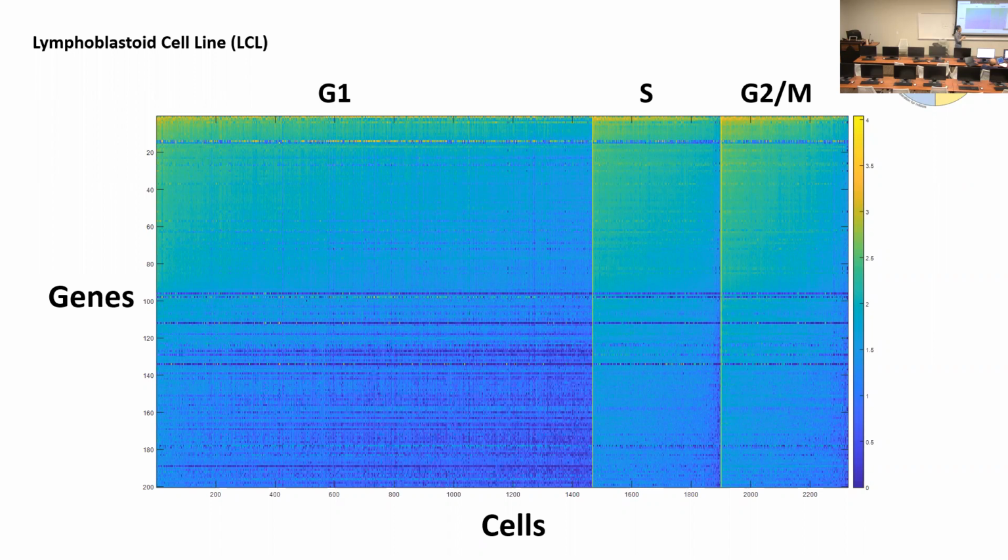But our definition of gene expression noise is that the cells have to be the same cell type and in the same state. Otherwise, it's not white noise. It's created by either a difference in cell type, subtypes, or cells in a different cycle phase. So it's not fair to use different cell subtypes or cells in different states to estimate variability. That's why we will get rid of this. We are not using cells in S phase or G2 phase, only cells in G1 phase.